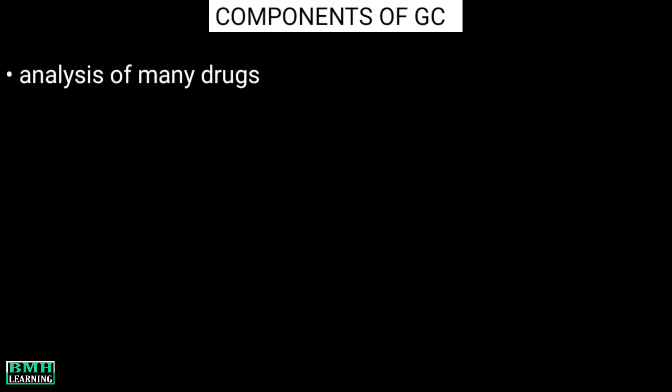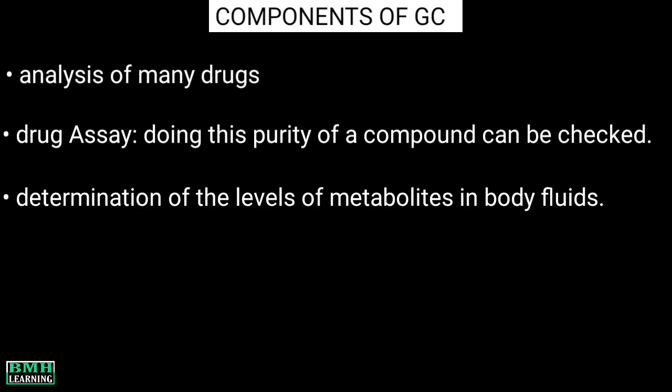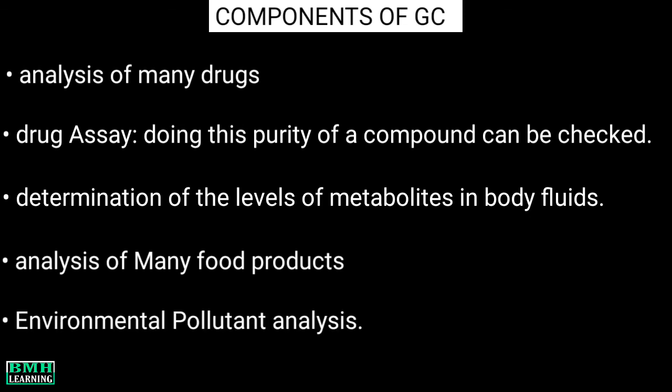The technique has many applications. It helps in the analysis of many drugs like antibiotics, antivirals, general anesthetics, sedatives or hypnotics. The method can be used for drug assay, and by doing this, purity of a compound can be checked. This is used in the determination of the levels of metabolites in body fluids. It's very helpful in the analysis of many food products. Environmental pollutants like formaldehyde, carbon monoxide, benzene, DDT can be analyzed with the help of this technique.